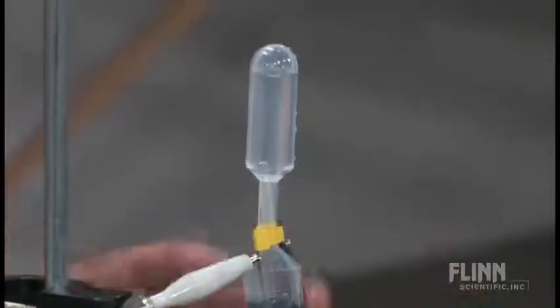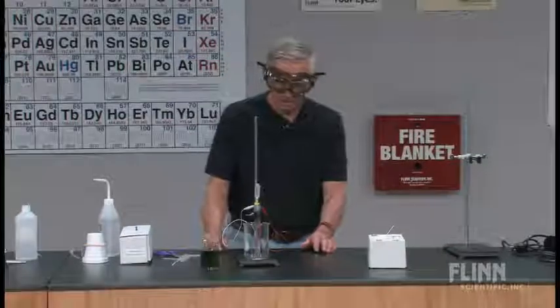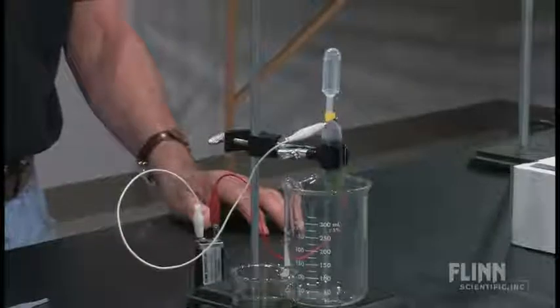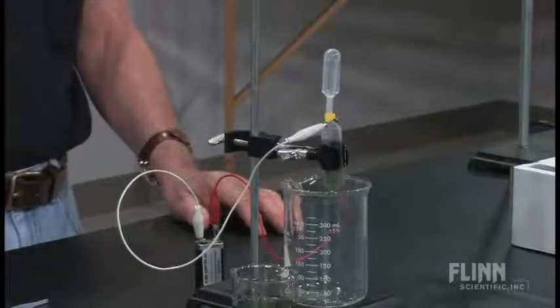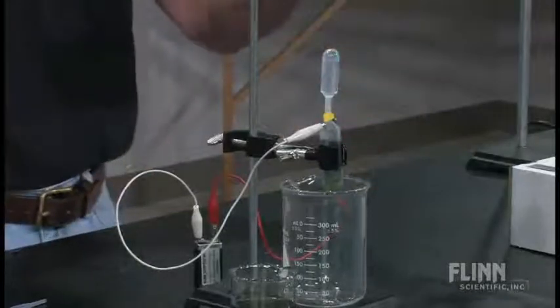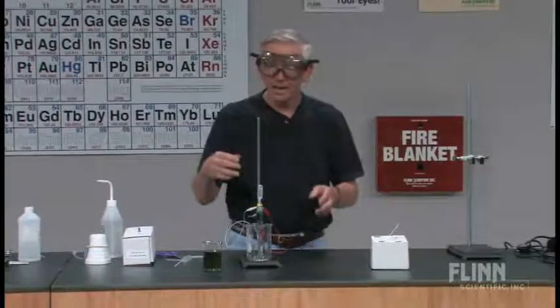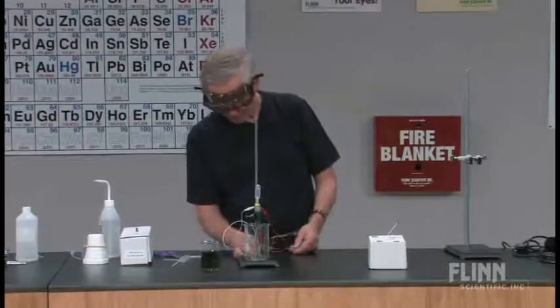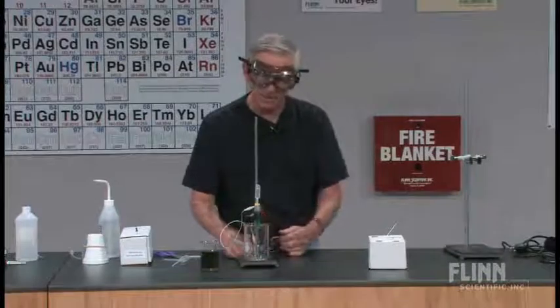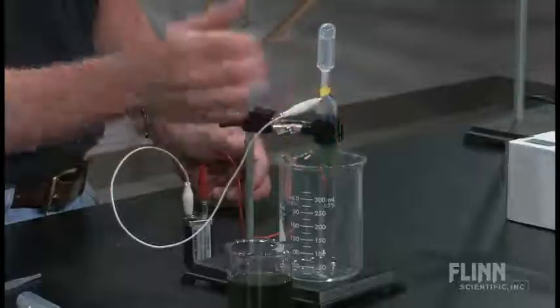This is the point at which I say, but on a molecular level, it's really exciting. In my classes, this clearly takes some time. This is where I go through and reinforce some of the chemistry that's going on. I can show them the battery. This is the negative electrode. This is the positive. What gas is being formed here? What gas is being formed here?